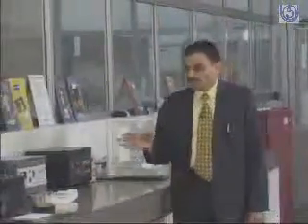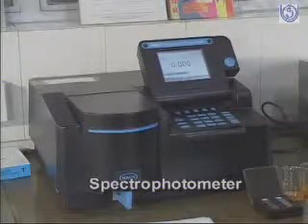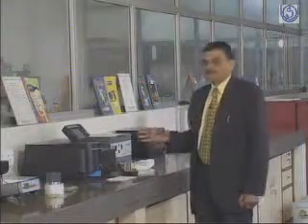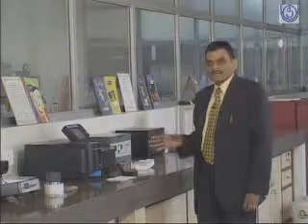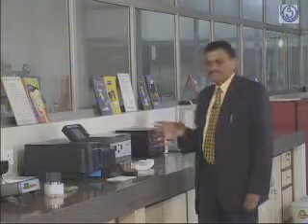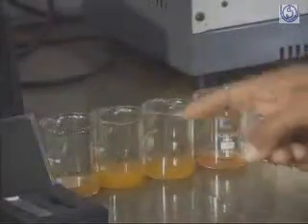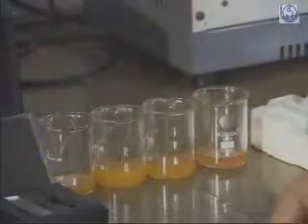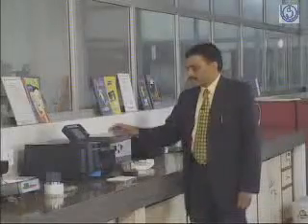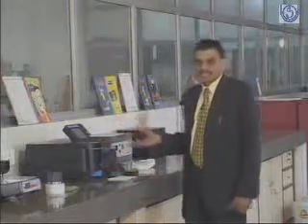Then I move to the next equipment. This is the spectrophotometer, where we do the estimations of different chemicals like iron, phosphorus, or the color. So these are different colored samples, or the color can be developed by a chemical reaction, and this can be estimated by this equipment, and ultimately the concentration can be known.